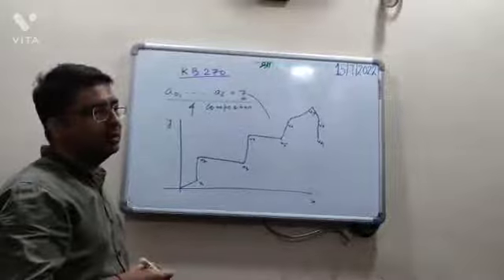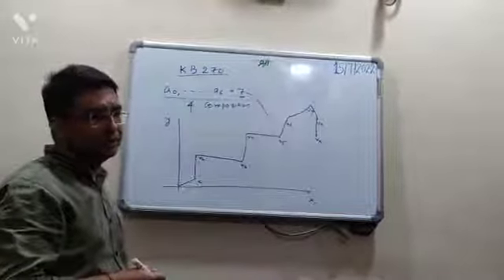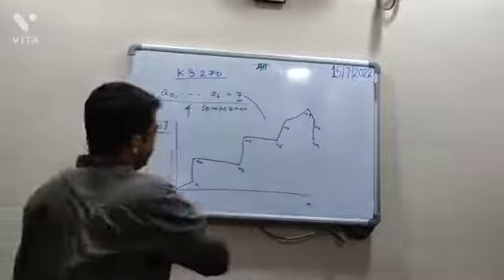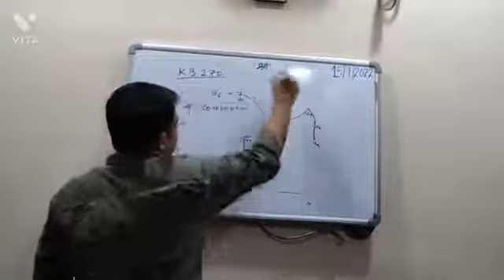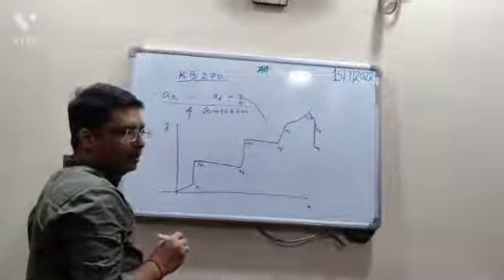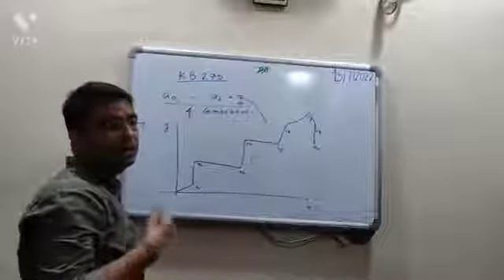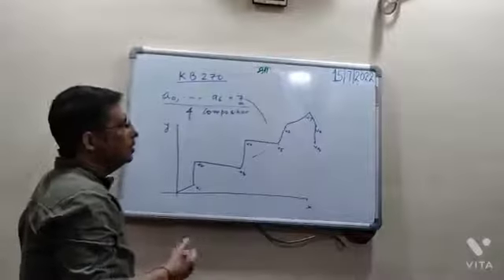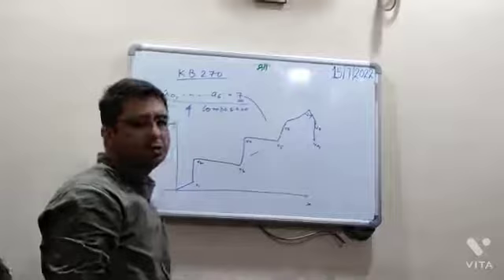Ultimately I have to use multiple coefficients, because it's a non-linear thing. If it is linear, it is a straight line. But this is non-linear, so I have to use multiple coefficients. Now the question arises, how many coefficients should I use?